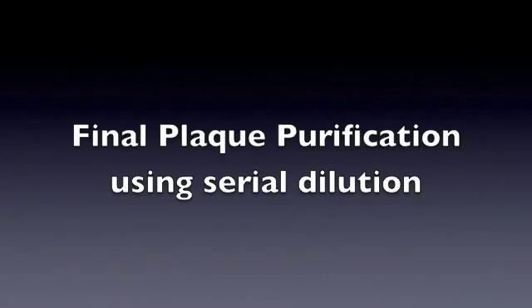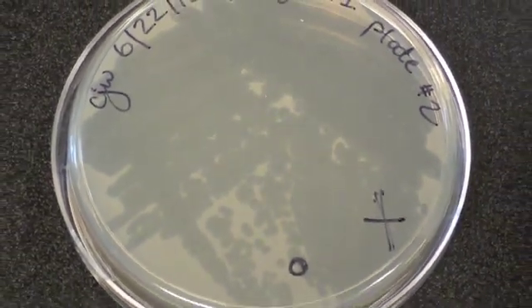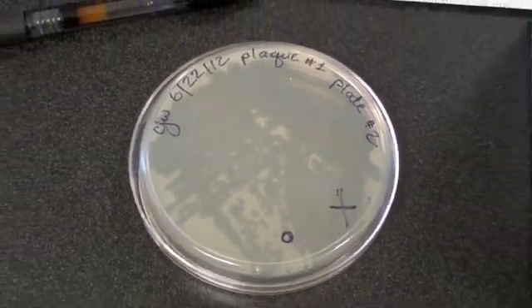This video shows you the final plaque purification step. From a streak plate, such as this well-labeled example, you'll pick one isolated plaque to purify.